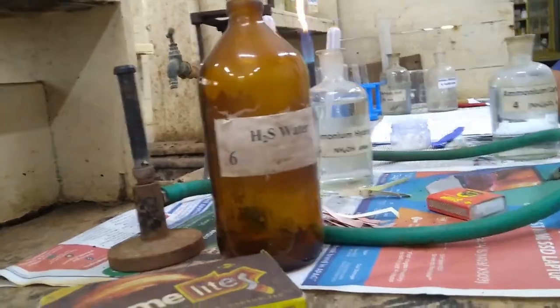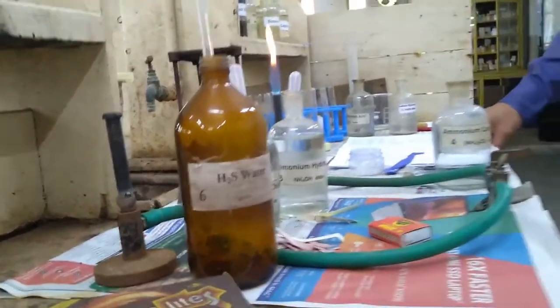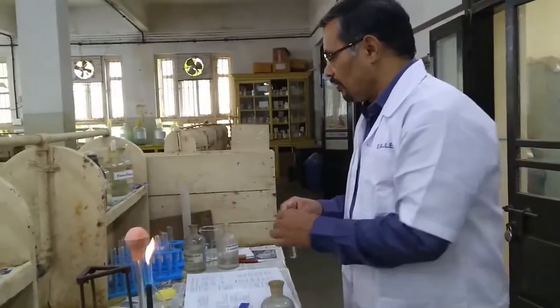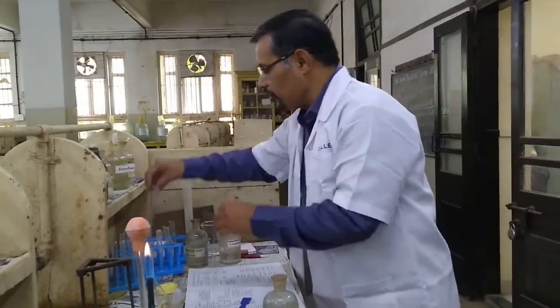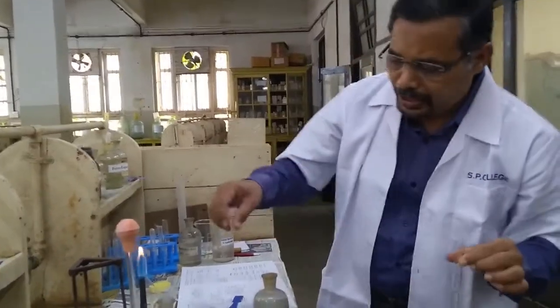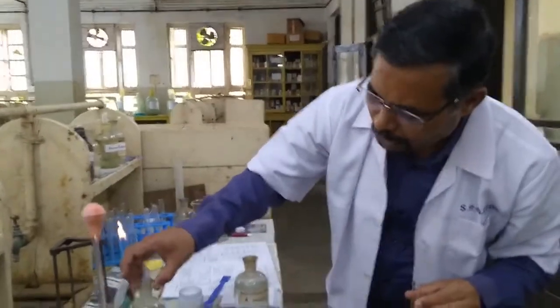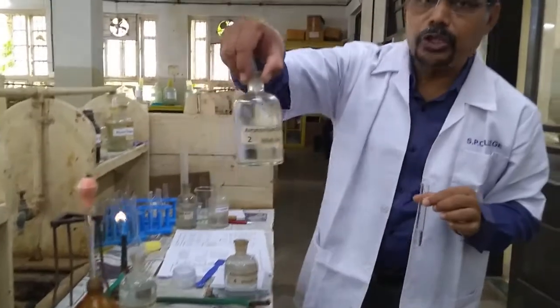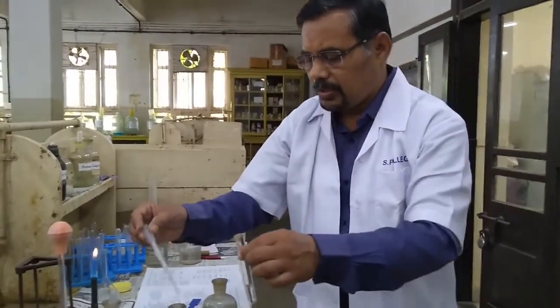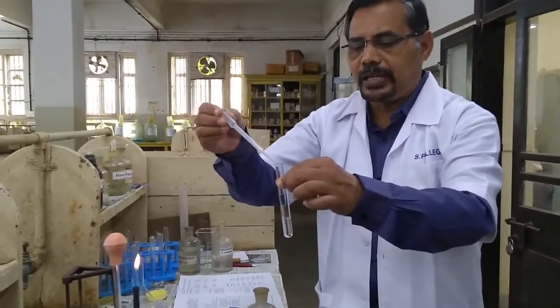Now we will go for the group 3 radicals. In the group 3 radicals, group 3A, the test is, I will take now the original solution. So this is the original solution. In that I will add a small quantity of ammonium chloride, that is NH4Cl. So a small quantity of NH4Cl is added.